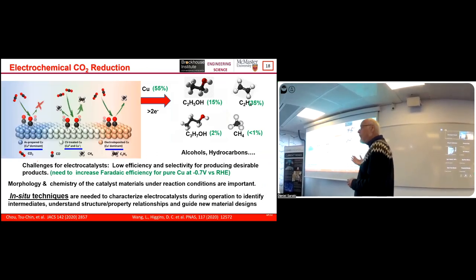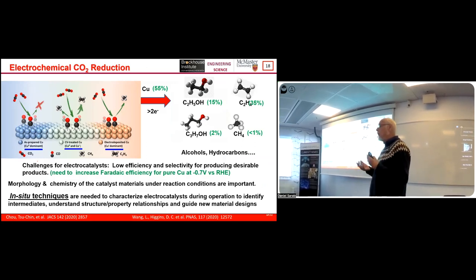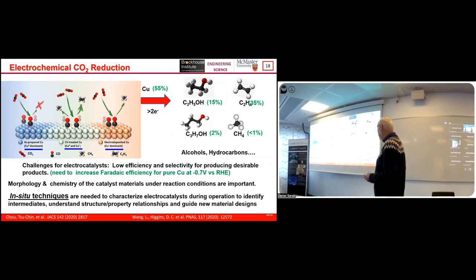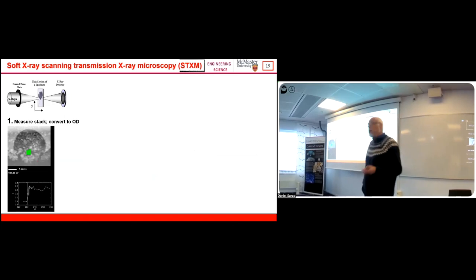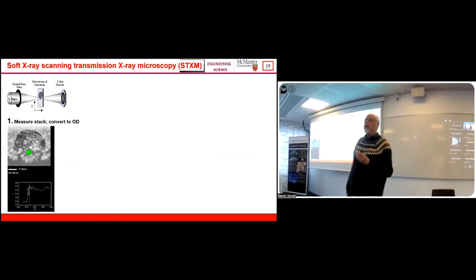And of course, that means from a chemist's point of view, you want to understand the mechanisms so that you can start to doctor the surfaces of the catalyst to push the reaction in the right direction. So again, motivation for in situ. So I'll give you a little segue on STXM because it's important to understand how we process our data.